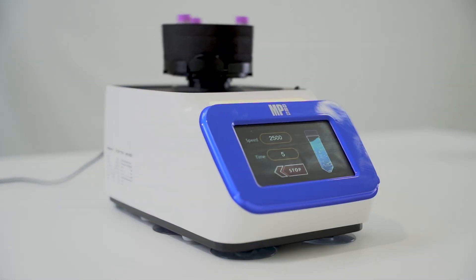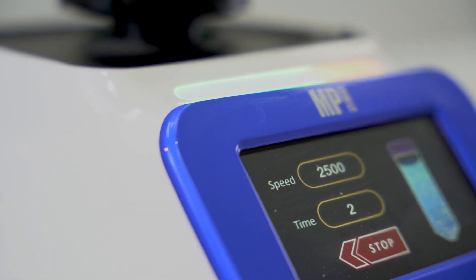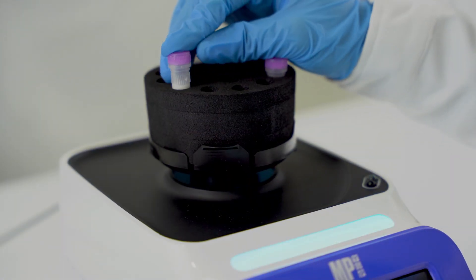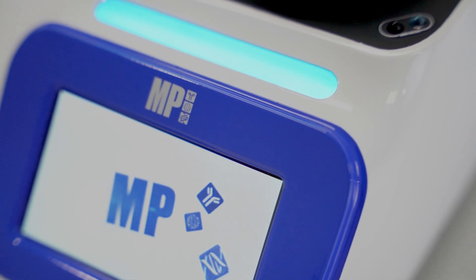Welcome to the future of laboratory mixing with the all-new Smart Vortanizer from MP Biomedicals. Engineered to ensure stability, designed for user-friendly operation, and focused on your comfort and safety. With its advanced stability features, the Smart Vortanizer ensures precise mixing without all the hassle that may disturb your samples or experiments.